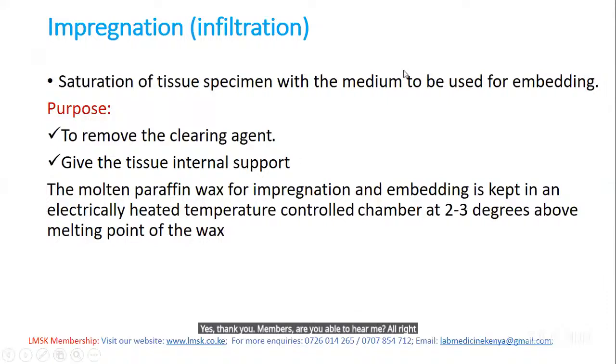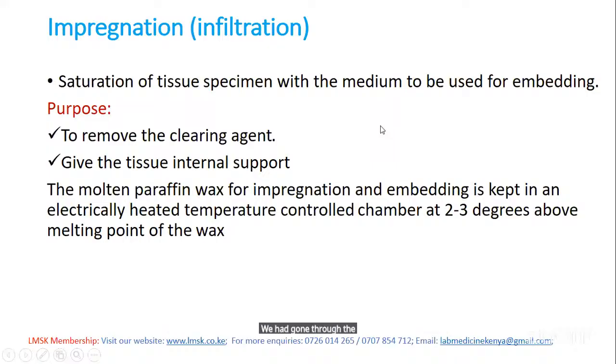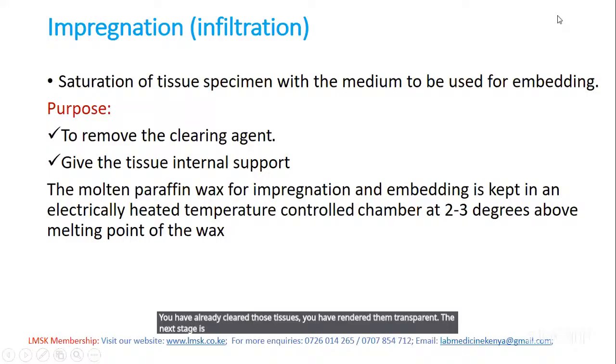All right. We had already processed our tissues. We had already grossed our tissues. We had processed until the stage of clearing. Now, the next stage after clearing the tissues, you have rendered them transparent. The next stage is infiltration or impregnation.